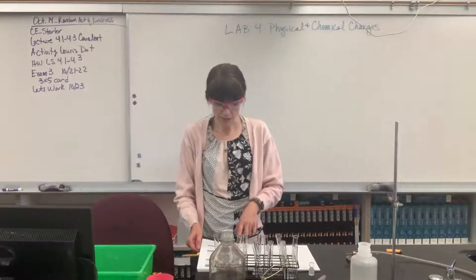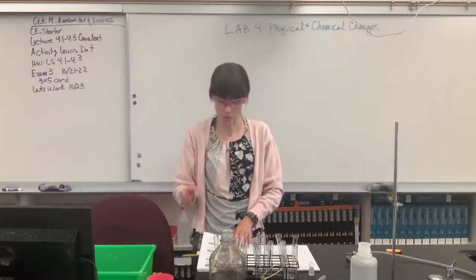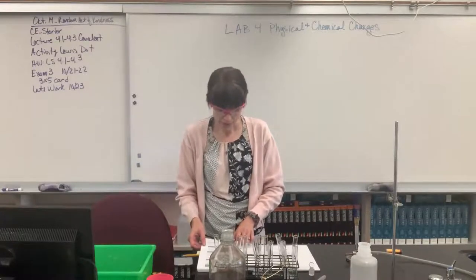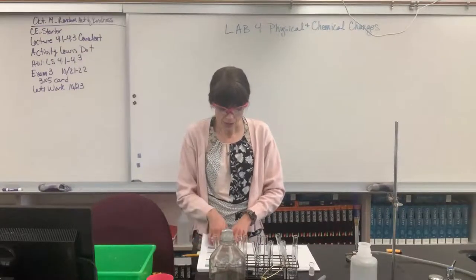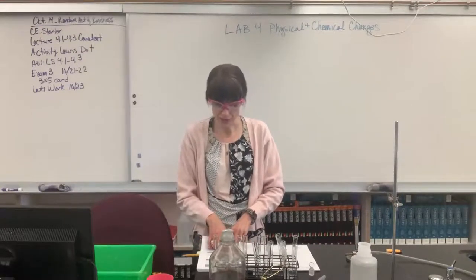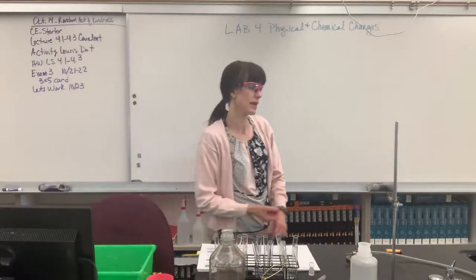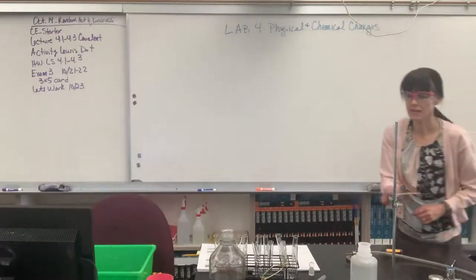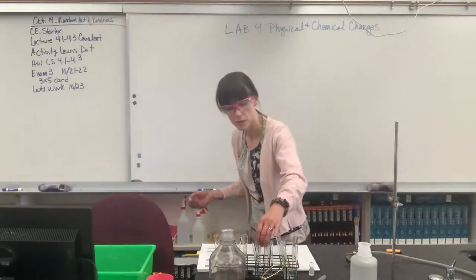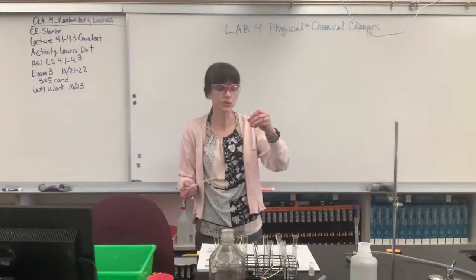I'm on part B where it says heating copper carbonate, and I'm on number 5 where it said allow the tube to cool for at least 10 minutes. Remember, this is our copper carbonate. Then on number 6, it says test the sample which has been changed by heating by following the directions in step 3. So step 3 is where we added the 15 drops of the HCl. So let's see what happens when we add 15 drops of HCl. Little side note, let me make sure it's cold after 10 minutes, so I can't feel it, it's room temperature.